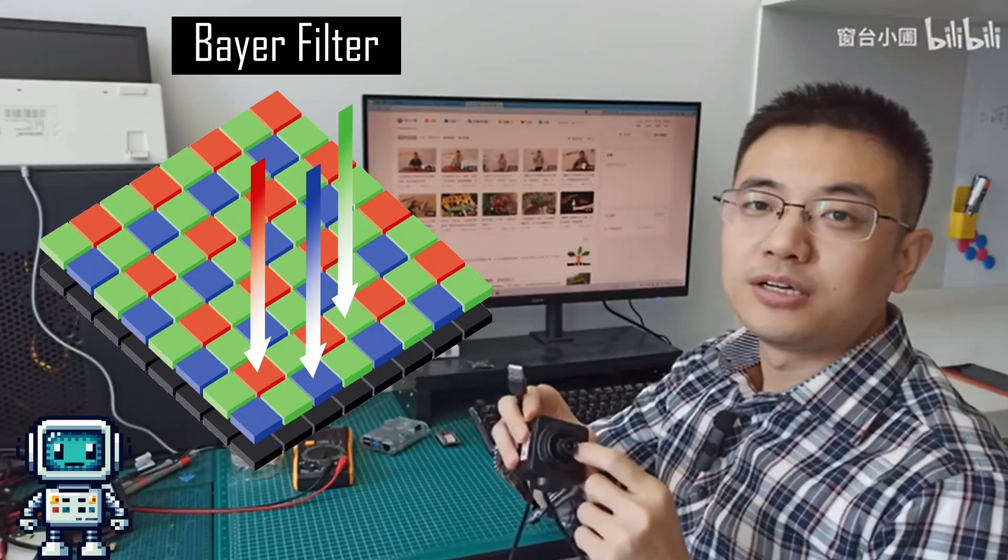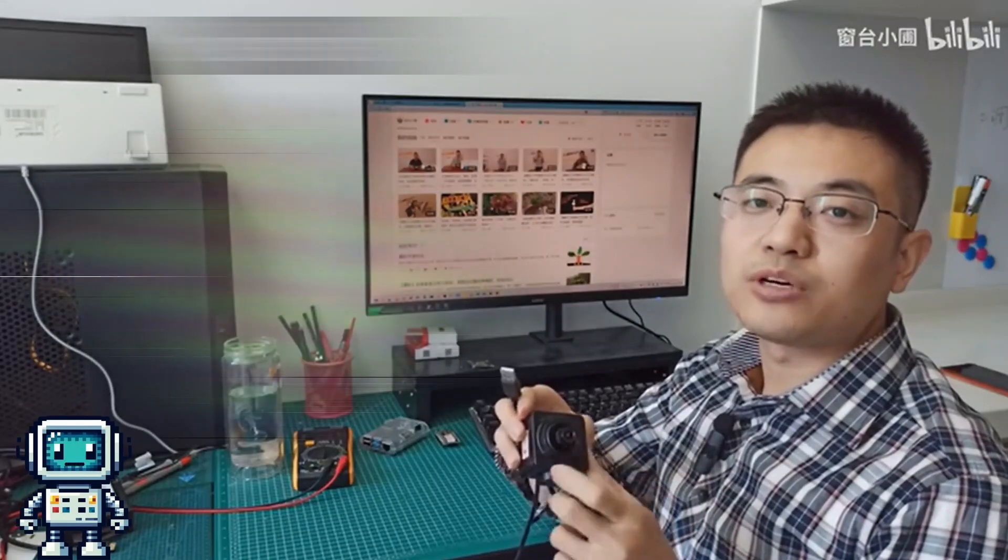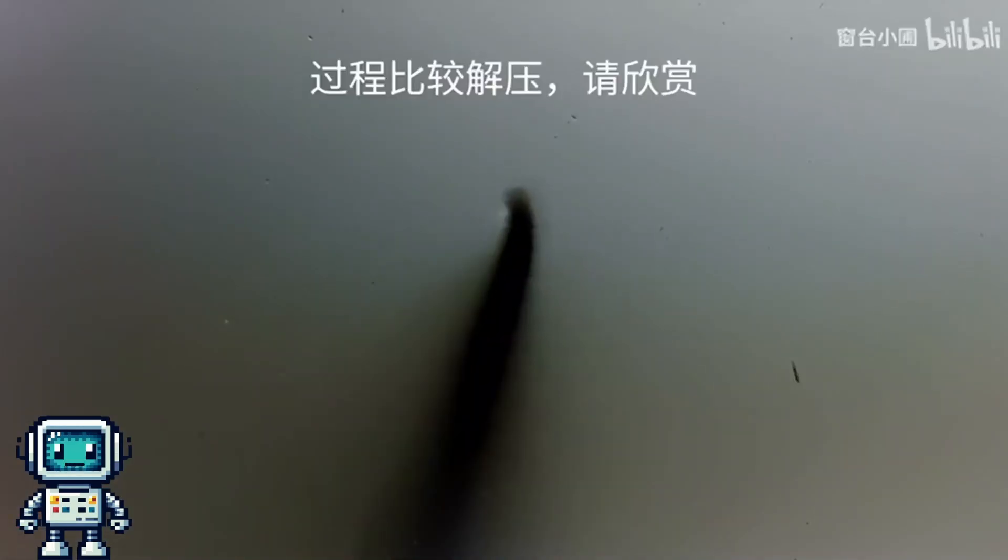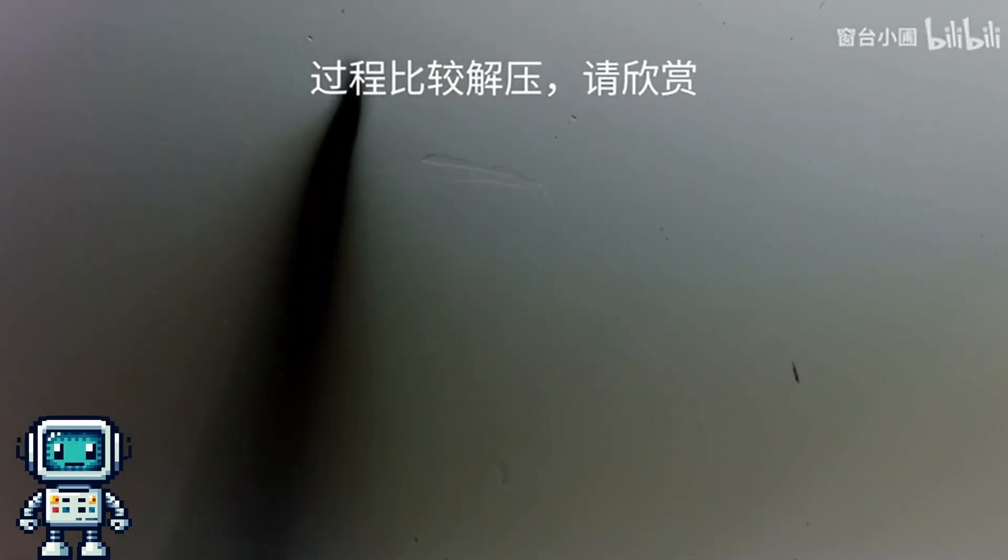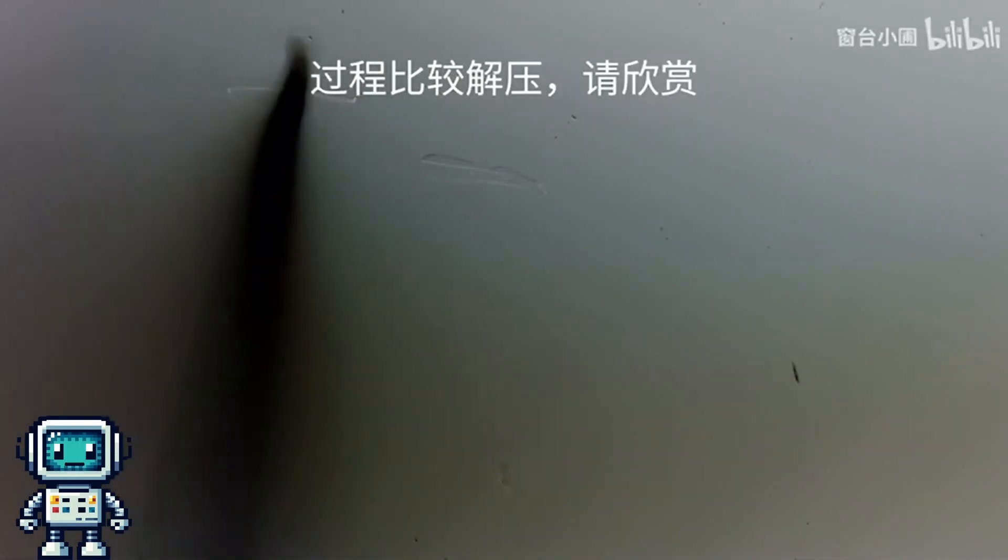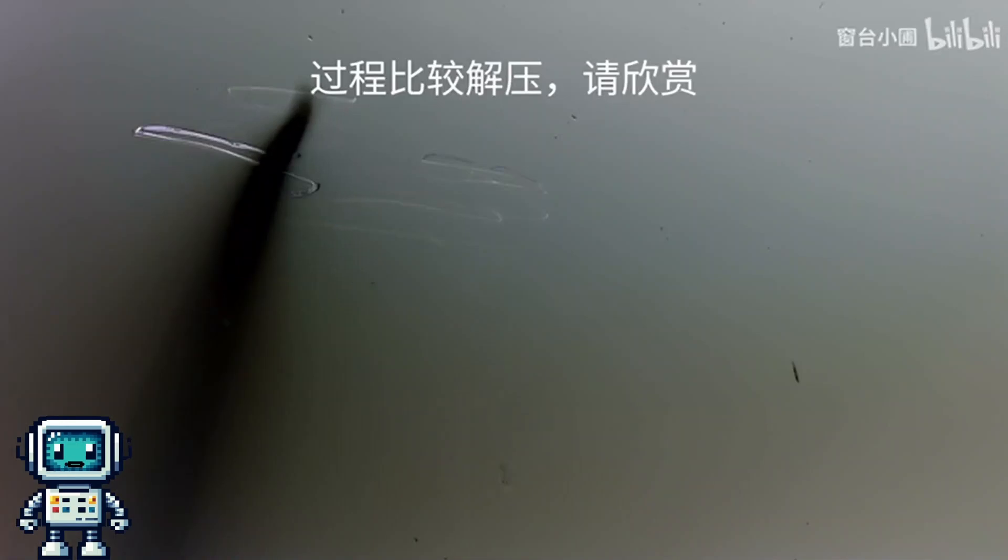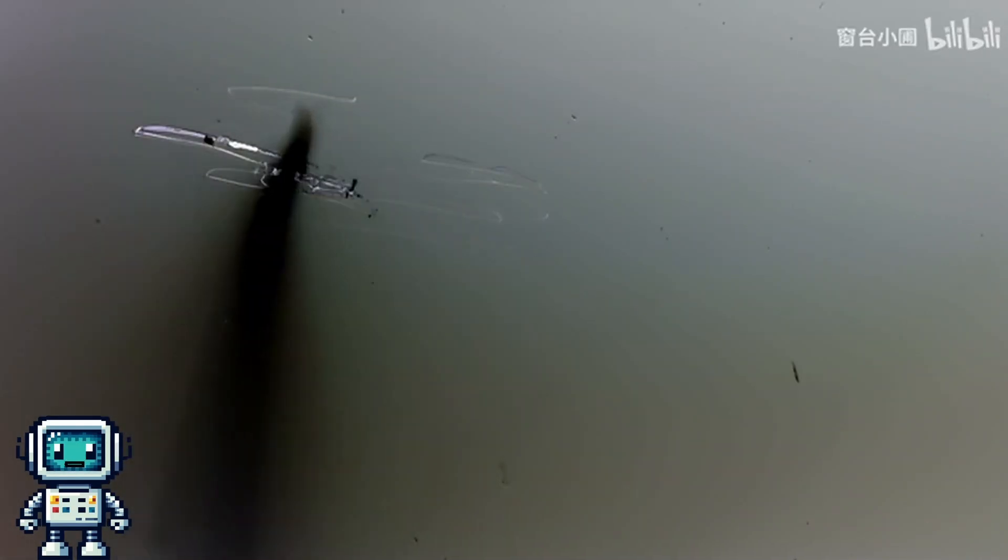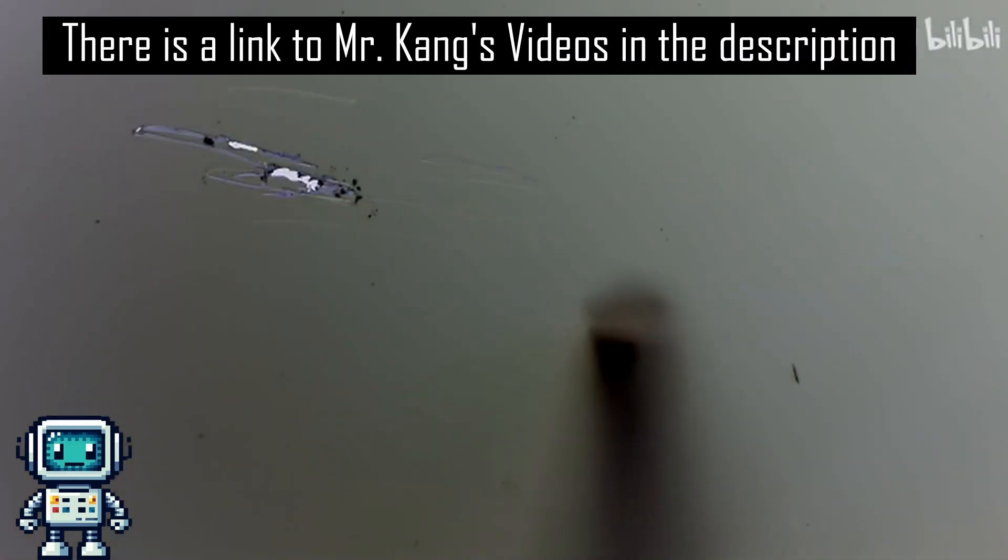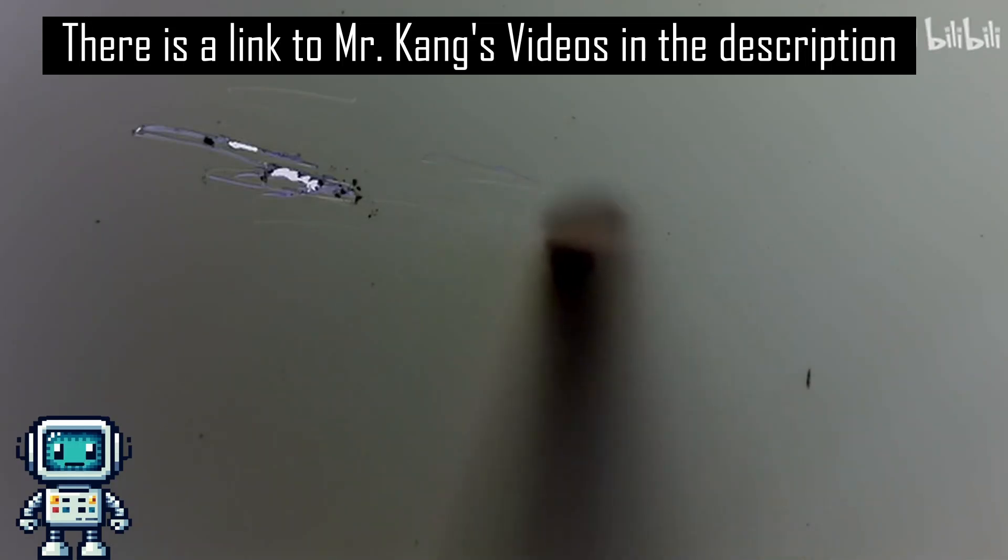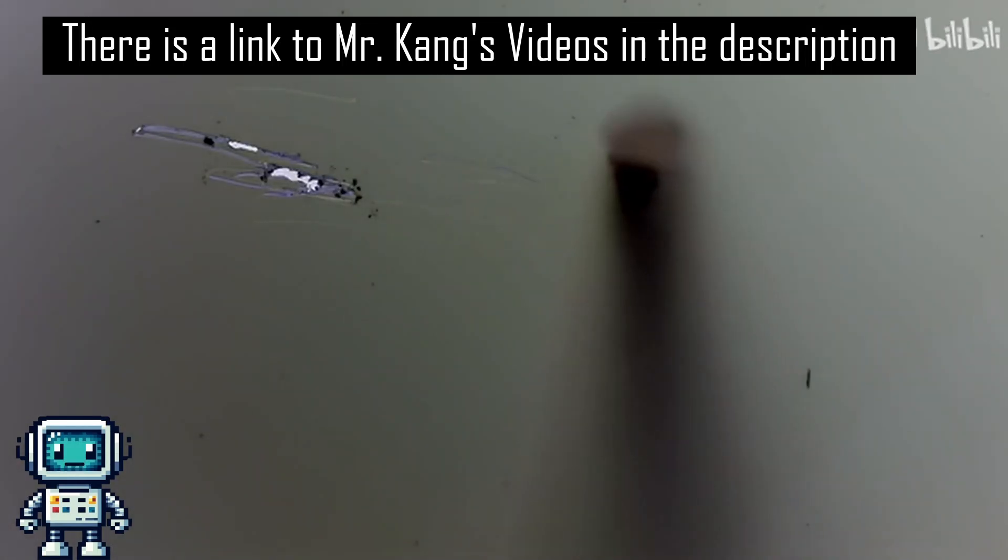It is this Bayer filter that prevents all of those other DIY spectrometer projects from achieving such a wide spectral range as this device. Removing the Bayer filter is a notoriously difficult process. You see, the CMOS image sensor underneath is incredibly easy to damage.